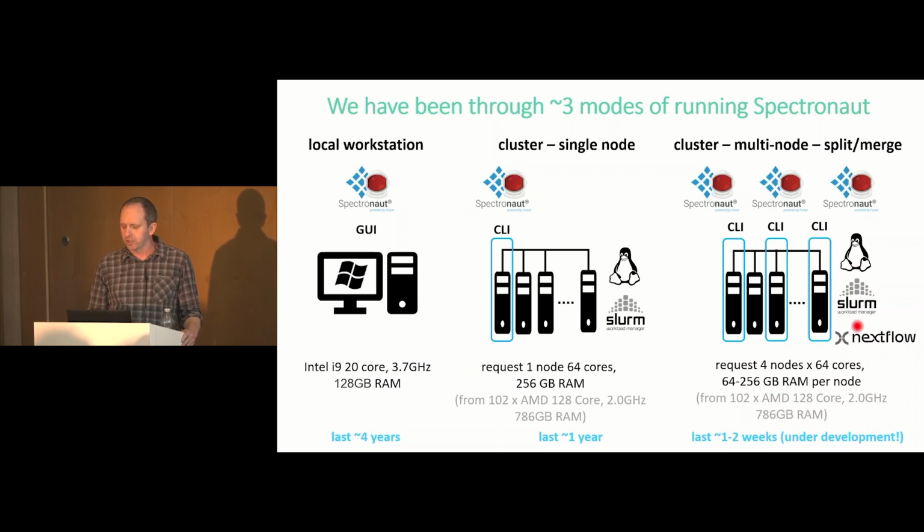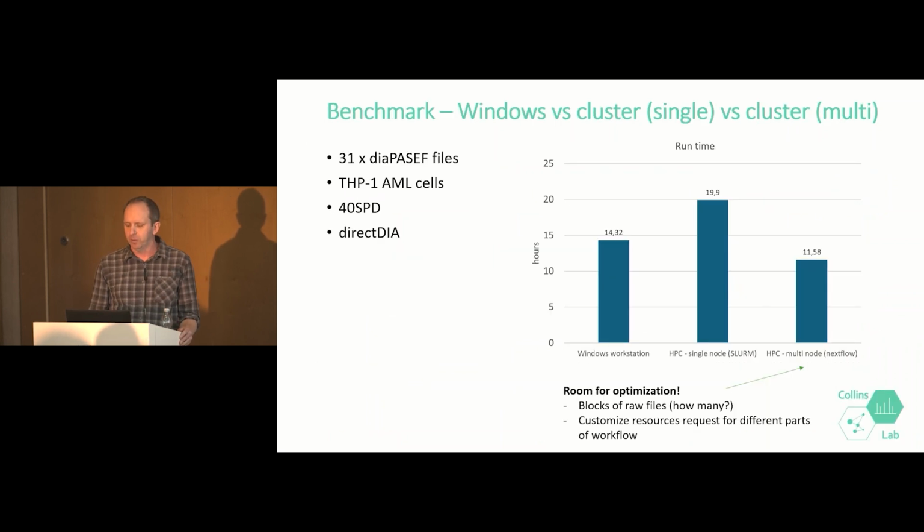And for this, we're using a workflow management system called Nextflow, which is a bit more flexible and is handling the job submission to the Slurm job scheduler, and it will be a bit more portable to different high-performance computing setups, we think, if we use this Nextflow pipeline.